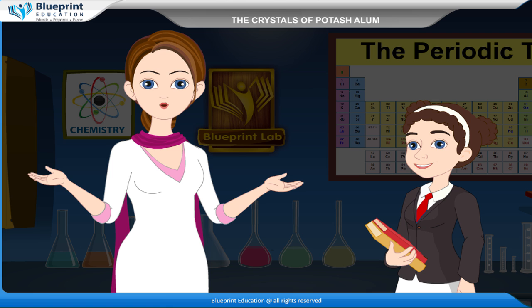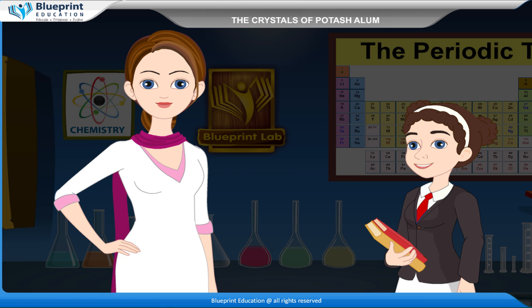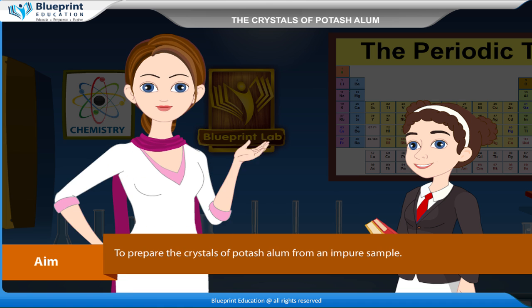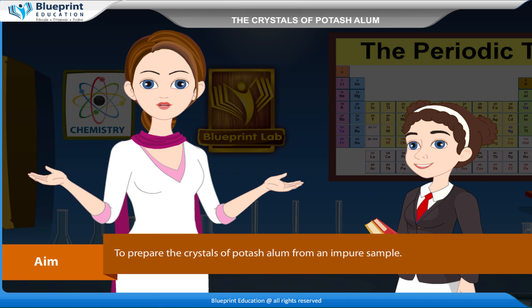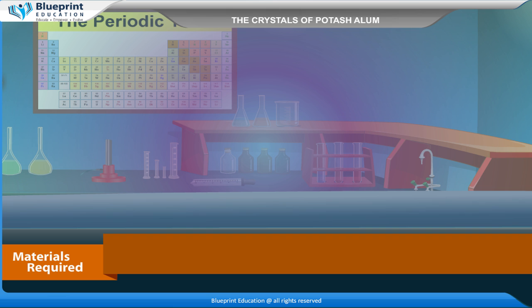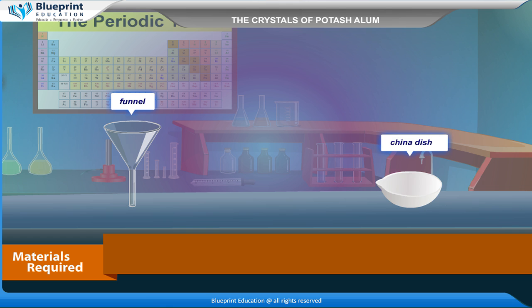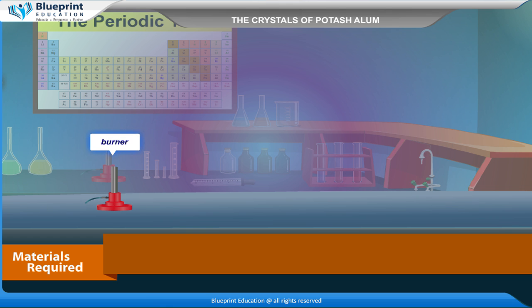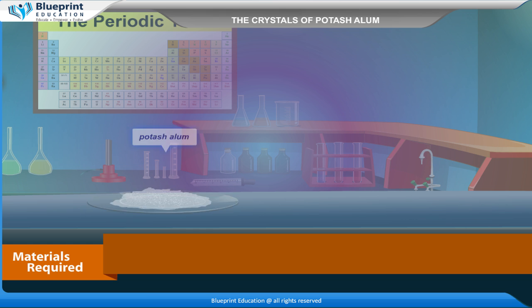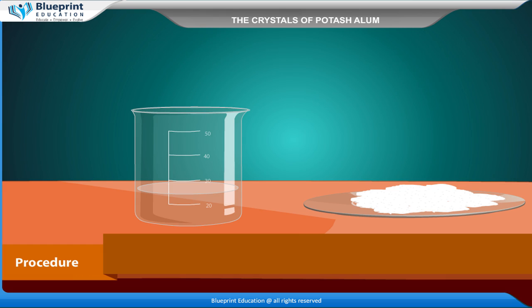Let's do an experiment to prepare the crystals of potash alum from an impure sample. Our aim is to prepare the crystals of potash alum from an impure sample. The materials required are: beaker, glass rod, funnel, china dish, burner, sand bath, filter paper, impure sample, and potash alum.